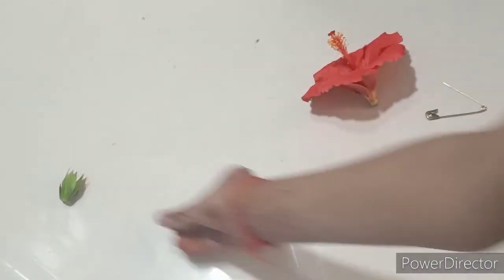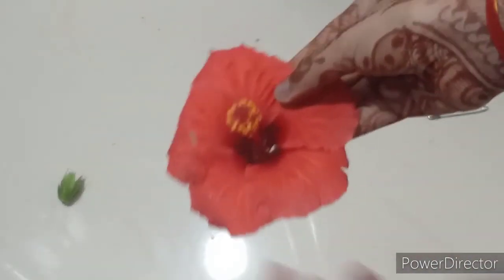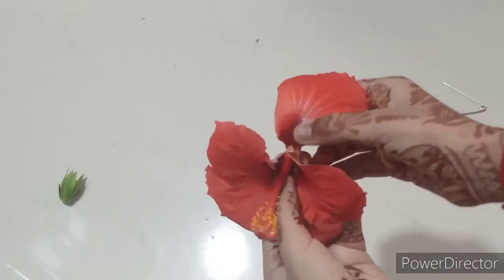Now I will start by taking out the petals. I won't use a safety pin for this — I will simply start plucking the petals out one by one.